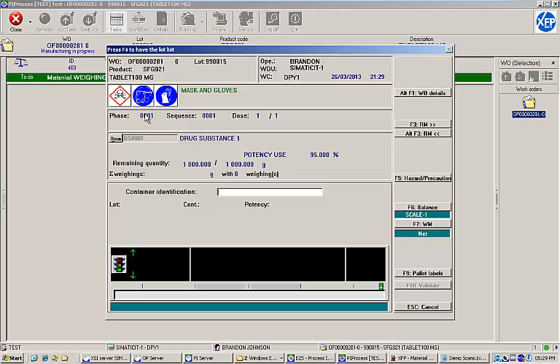The weighing screen contains all of the information that an operator needs to identify and weigh the right quantities of the right materials to satisfy the work order. Along the right side of the screen are navigation buttons that allow us to perform various tasks.